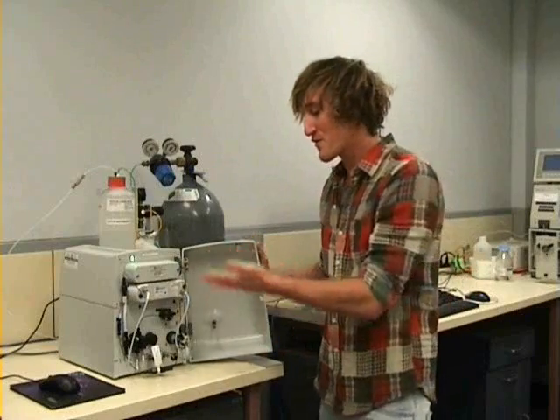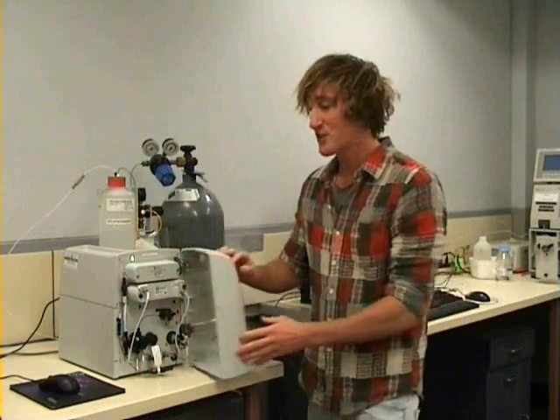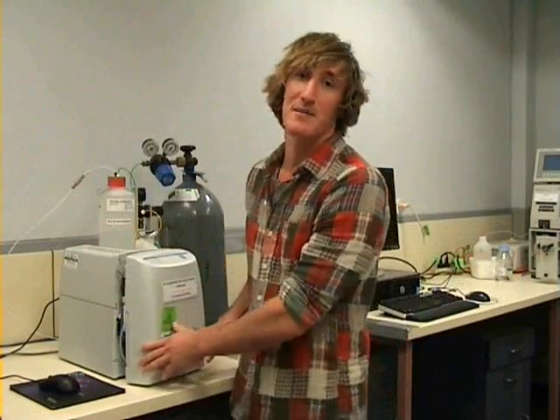So now that we've gone through a quick run-through of the ion chromatographic system, you should have a basic understanding of how this works in a laboratory situation.